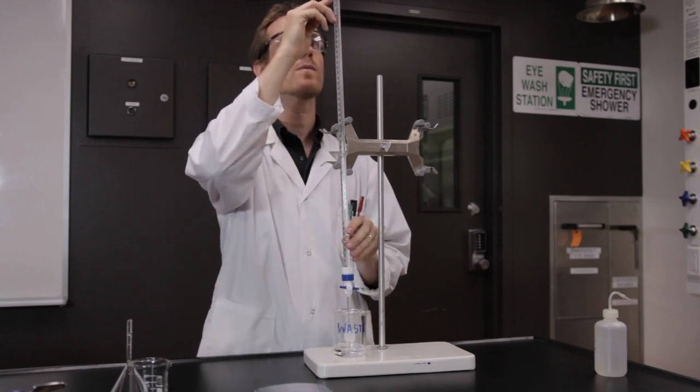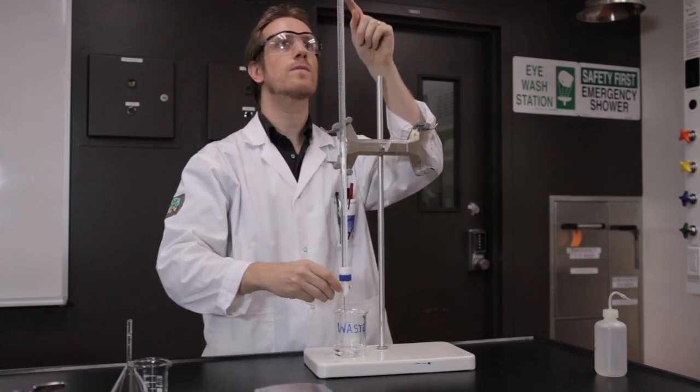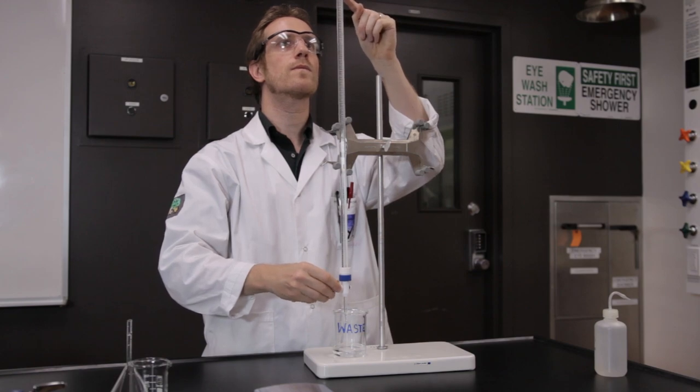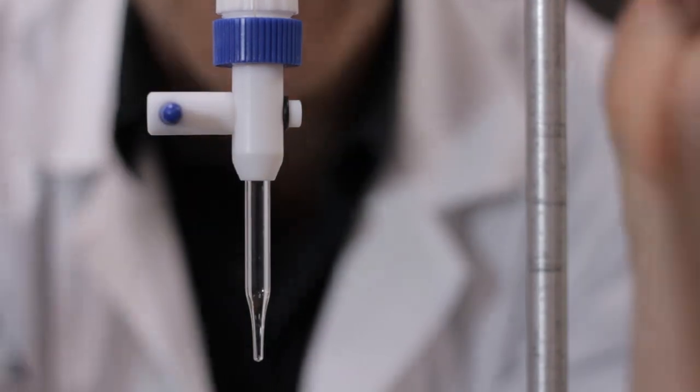Place the waste beaker under the tip. Open the stopcock full force to drain and fill the tip. Ensure there are no air bubbles. You may have to flick the tip or rotate the stopcock 180 degrees.